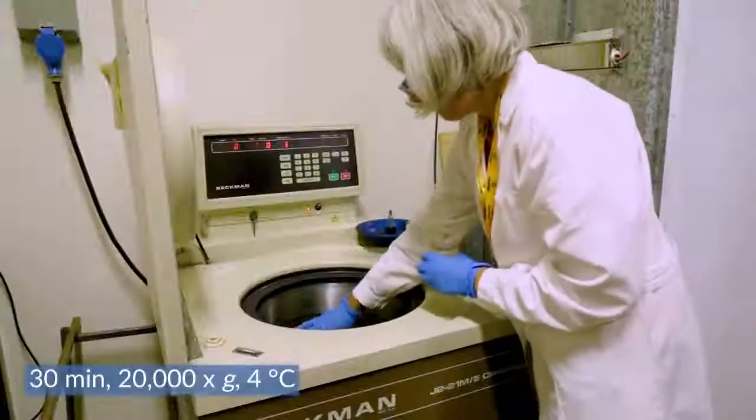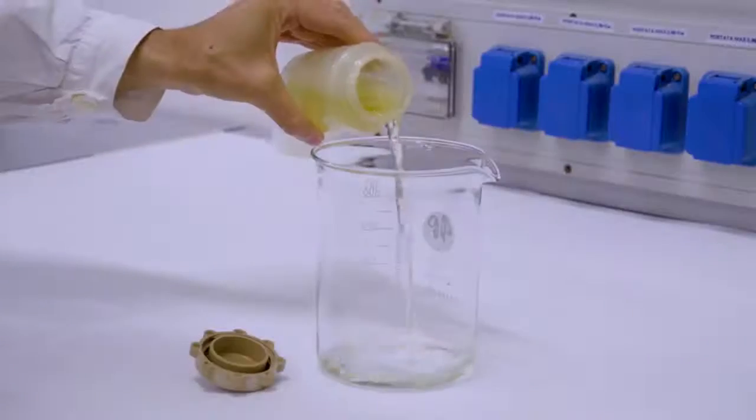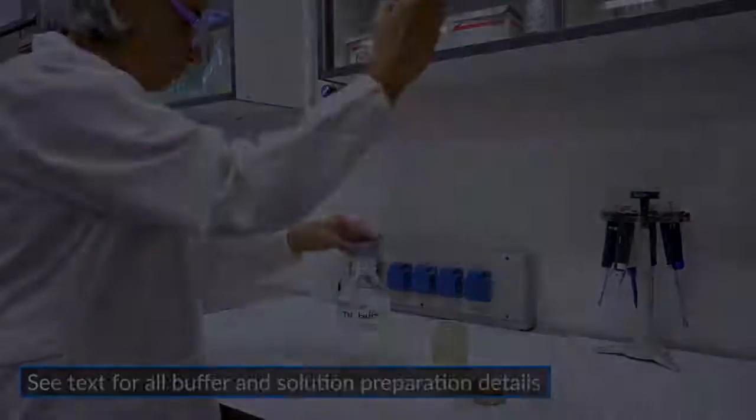The next morning, precipitate the phage by centrifugation. At the end of the centrifugation, remove the supernatant and carefully dissolve the phage.